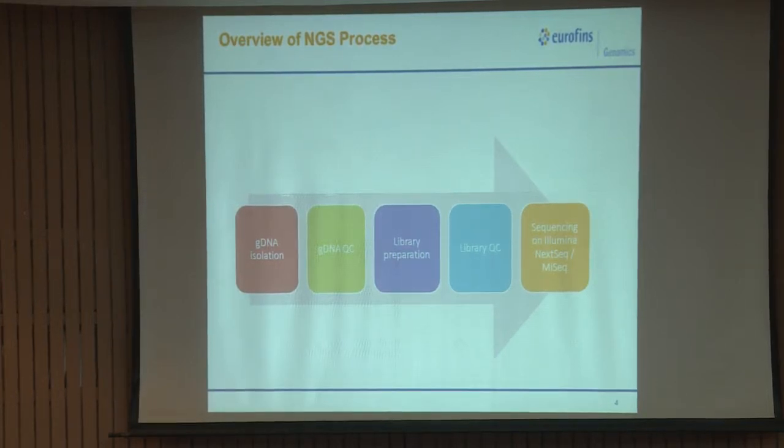So, when I am doing that, if I have 1000, I only have 150 and 150, it is a huge gap in between, and this gap is very important, we will see how it is important for assembly, right. So, for that we do a library QC and we know that the library of a paired end library should be somewhere around 300 to 400 base pair.